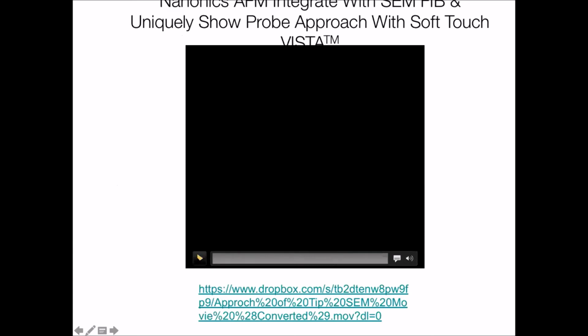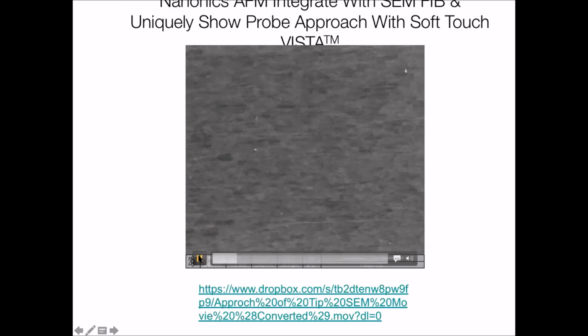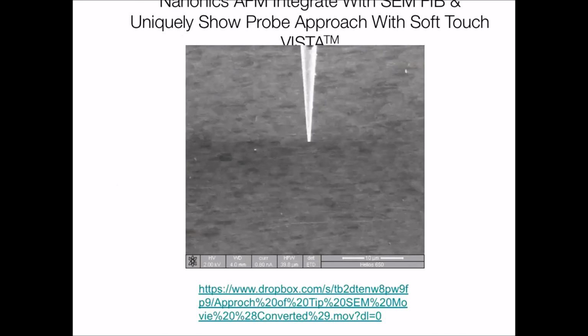Aaron, so this is the tuning fork, or is this a different probe than what you gave? No, you're right. I'm coming to that in a minute, okay? Okay. So you can see here the approach, a movie of the approach of the probe to the surface. It's a smooth, beautiful approach, and that's because of what Near is actually talking about right now, okay?